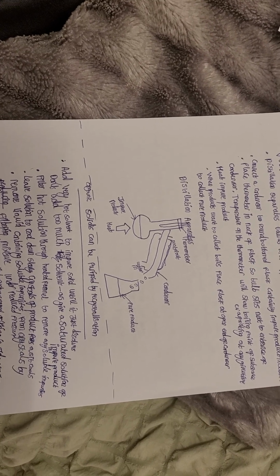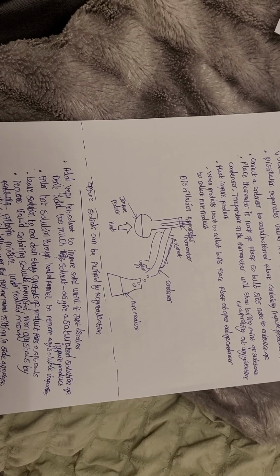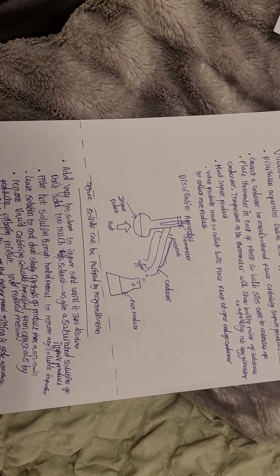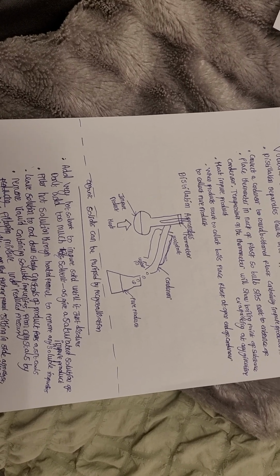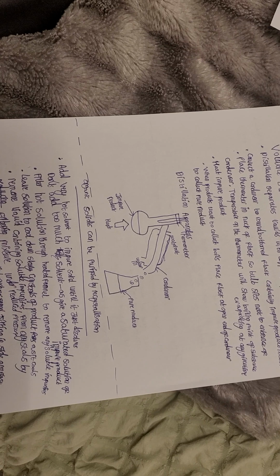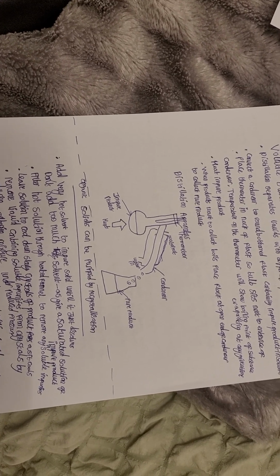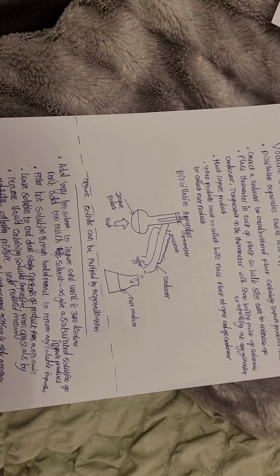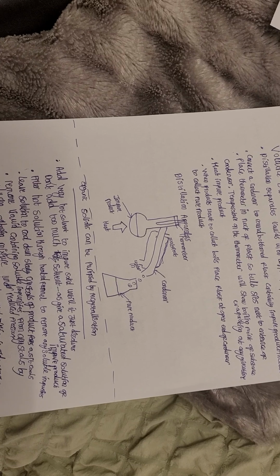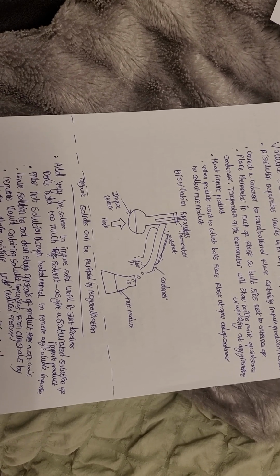You want to filter the hot solution through a heated funnel to remove any insoluble impurities. Leave the solution to cool down slowly, and you can see crystals of product form as it cools. We want to remove the liquid containing soluble impurities from the crystals, and we do this by filtering the mixture under reduced pressure.